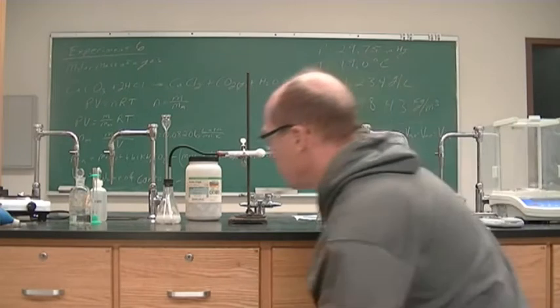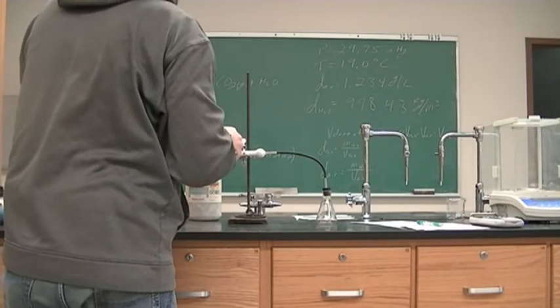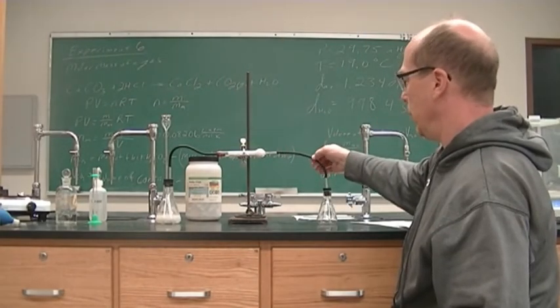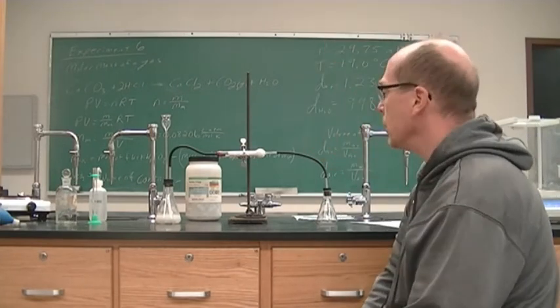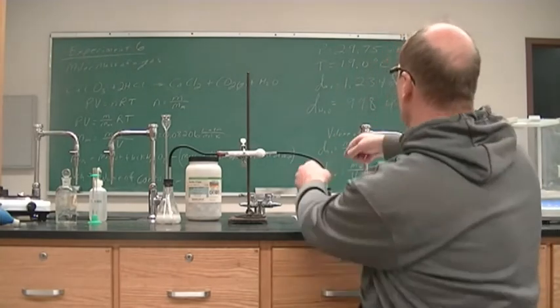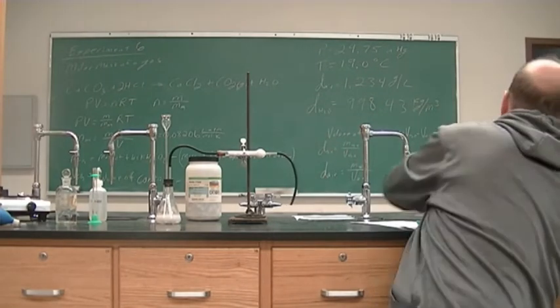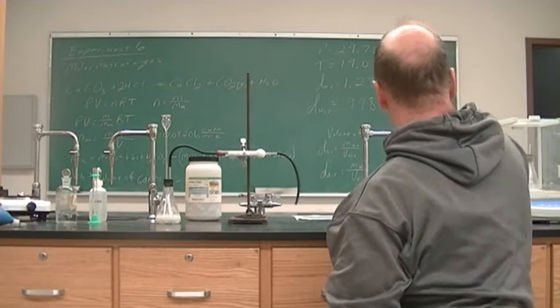All right, we'll let it go, add a little more HCl. Generating CO2 at a very large amount of volume of CO2. We'll let it go for another minute or so. We'll weigh it again. Whenever we get masses that are the same twice, then we know that it is completely full of CO2. That is 69.2177.